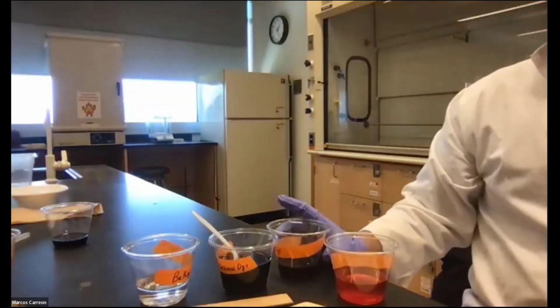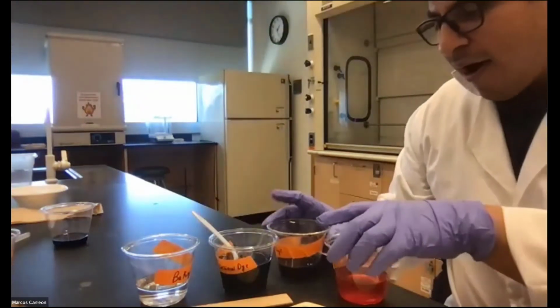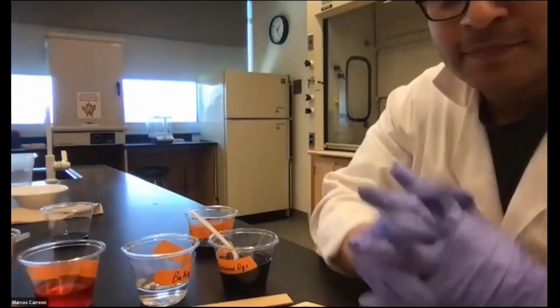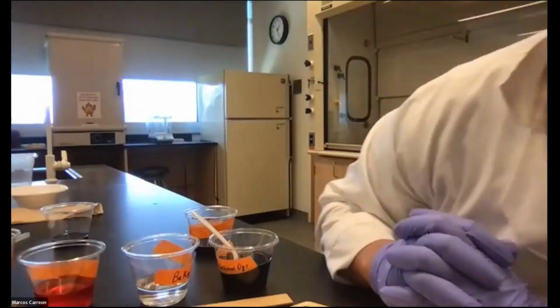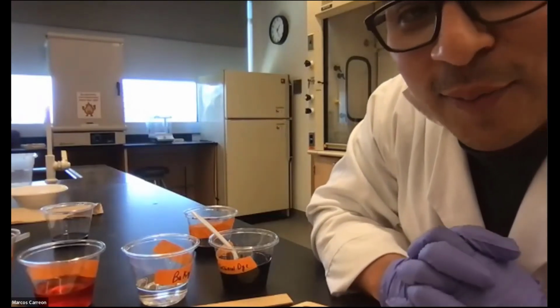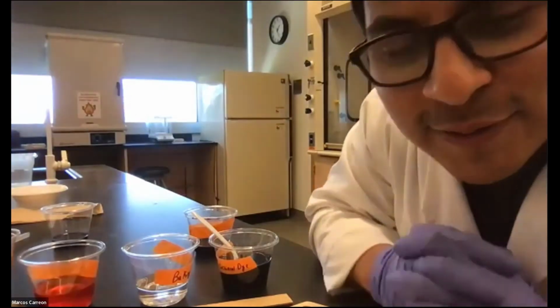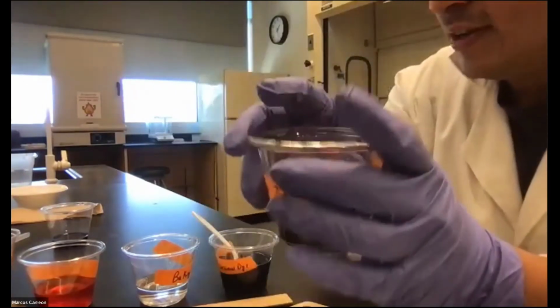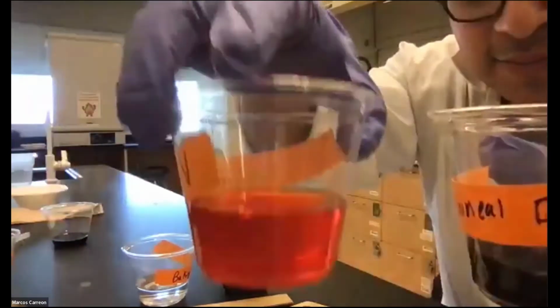So you can grab the vinegar. My lab mate here, Lynette, is gonna grab some more vinegar so you guys can see it one more time, because it's pretty cool. It's going from this dark red color, and then somehow it's going to this brighter color.